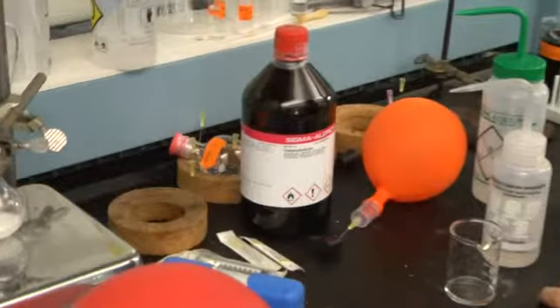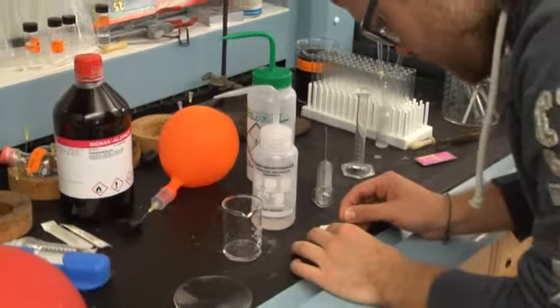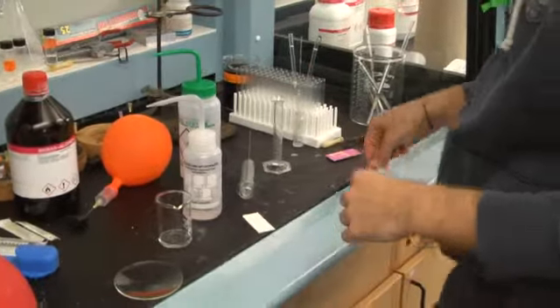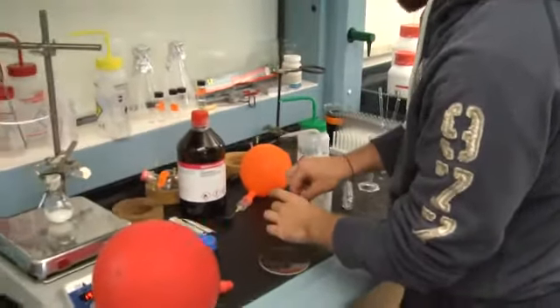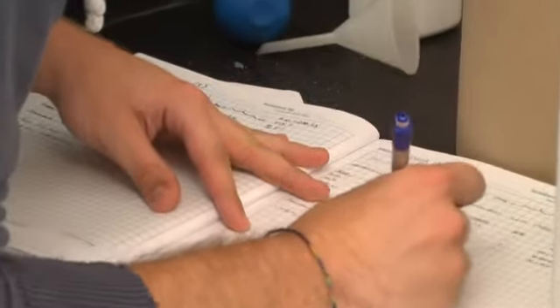My days in the lab are usually spent running reactions, trying to get from one step to the next step to eventually figure out if we can synthesize this molecule the way that we think we can.